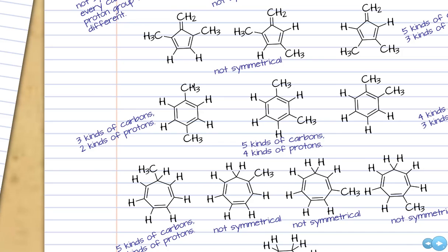And here's two methyl groups. And they're the same, because, again, if I rotated that molecule 180 degrees, they look exactly the same. So this seems to fit the bill with the proton NMR. Got alkenes, we've got methyl groups that we saw in the mass spec, and we have six of one kind of signal and four of another kind of signal.